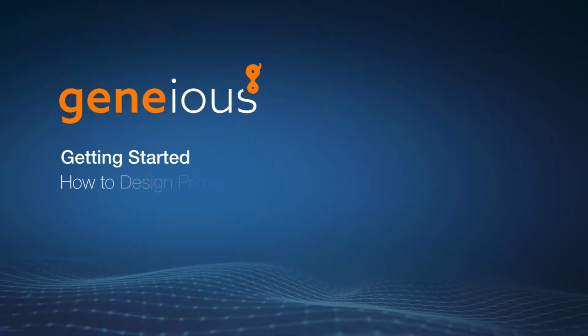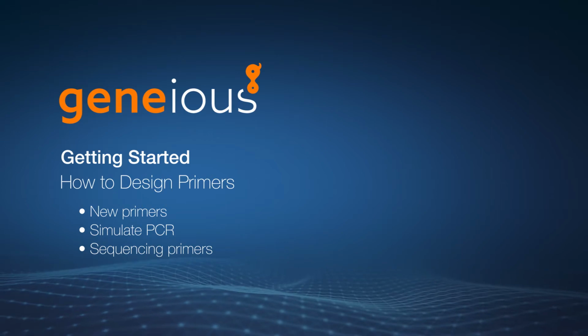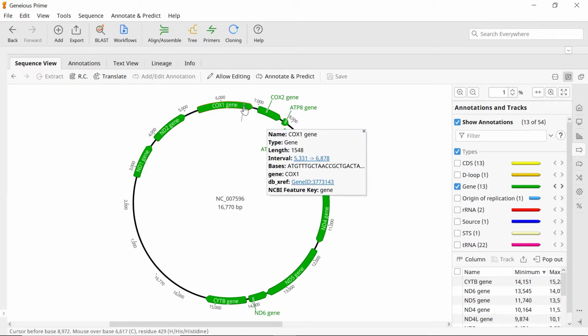In this Getting Started tutorial, I'm going to demonstrate how to design primers with Geneious Prime. To start with, I will demonstrate how to design new primers. In one of my files, I have a mitochondrion sequence from a woolly mammoth. What I want to do is to design primers that will amplify part of the COX-1 gene.